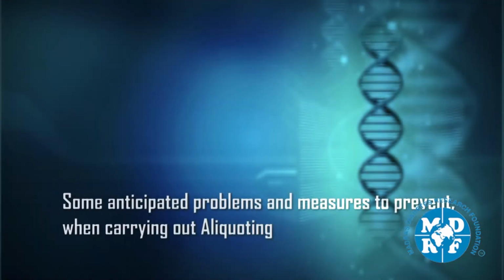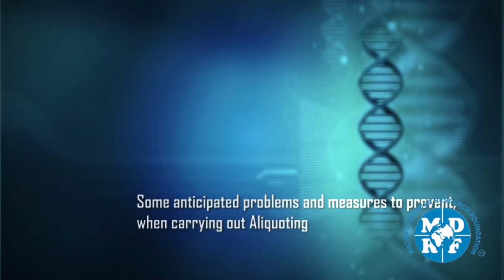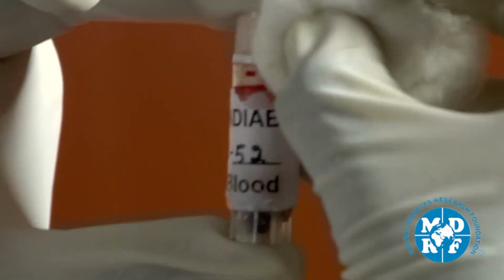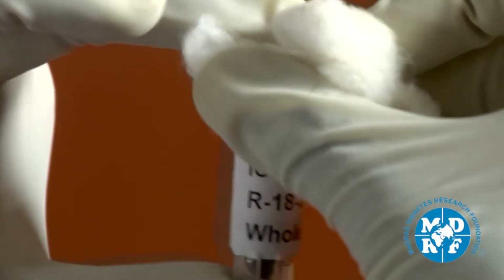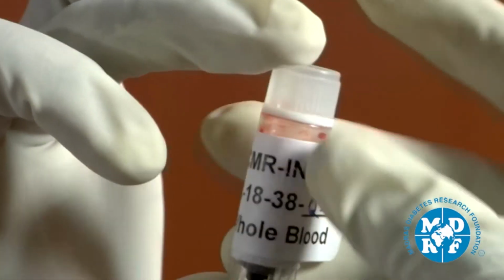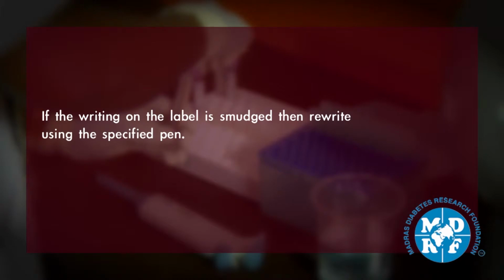Some anticipated problems and measures to prevent when carrying out aliquoting. If the sample spills, wipe off and then ensure that the caps of vials are tight and intact. Please try to avoid wastage of sample. The entire procedure of aliquoting and labeling should be done carefully. If the writing on the label is smudged, then rewrite using the specified pen.